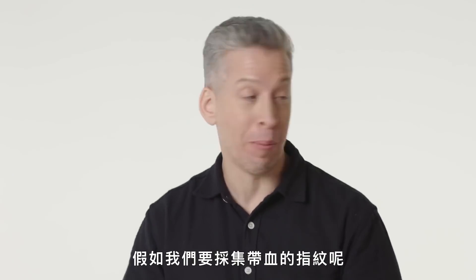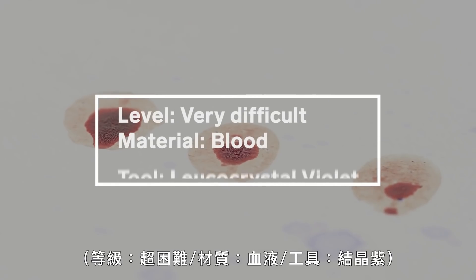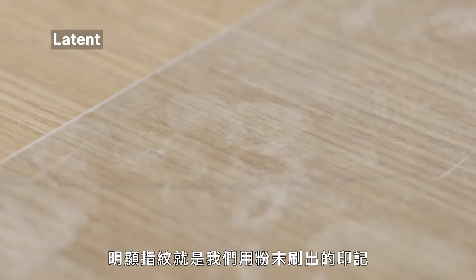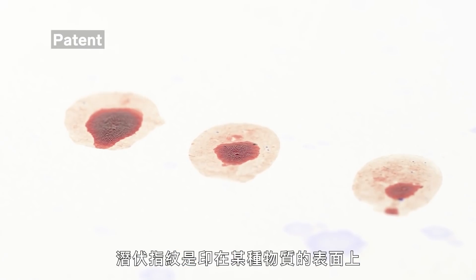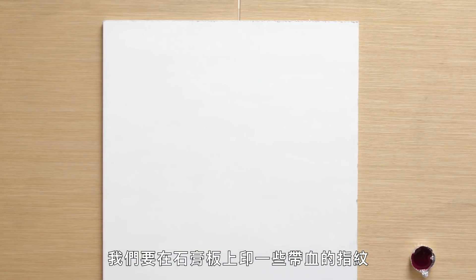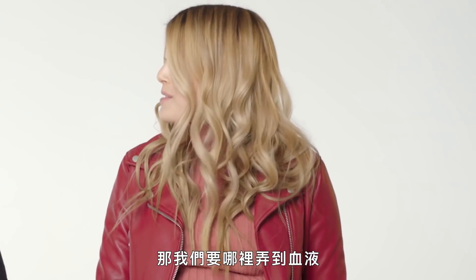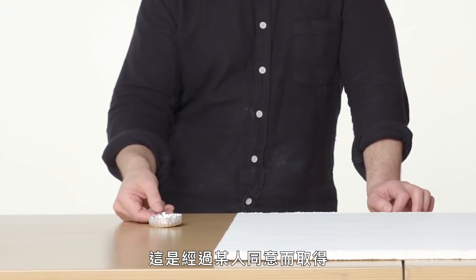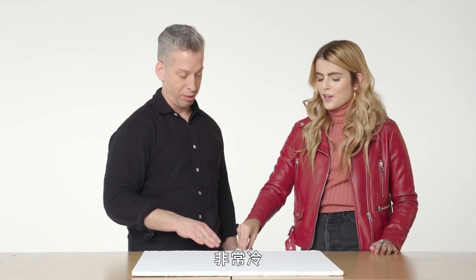Now let's make it harder — what if we have a bloody fingerprint? There are three different types of impressions at a crime scene: latent, patent, and plastic. Latent is what we already developed with fingerprint powder. Patent is where it's impressed in some substance — blood, mud, oil. A plastic print is impressed in a soft surface. We're going to create some bloody fingerprints on drywall and use a chemical to process and enhance the detail. The blood was taken with someone's permission, has been treated, and is very safe.